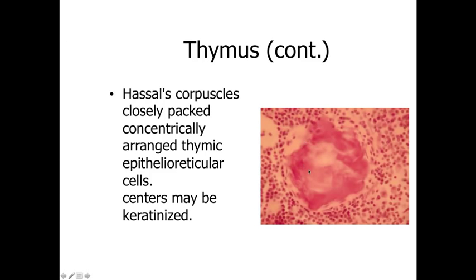Another identifying characteristic of the thymus is the thymic corpuscles, sometimes called Hassall's corpuscles. These are concentric areas of epithelial reticular cells that may become keratinized, forming a cluster or aggregate. We can see lots of small basophilic T lymphocytes surrounding these structures, and the epithelial reticular cells forming this keratinized cluster are a key identifying characteristic of the thymus.